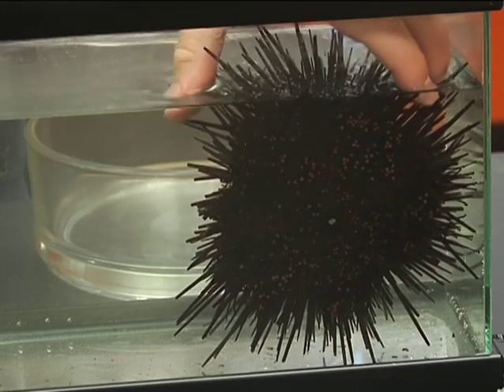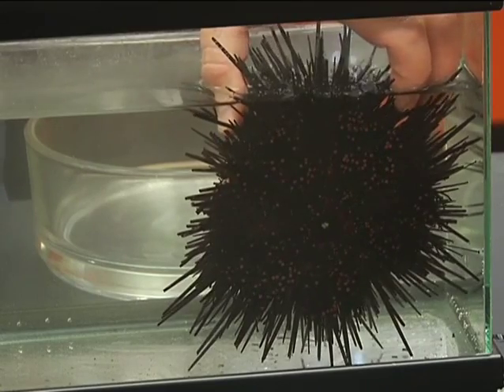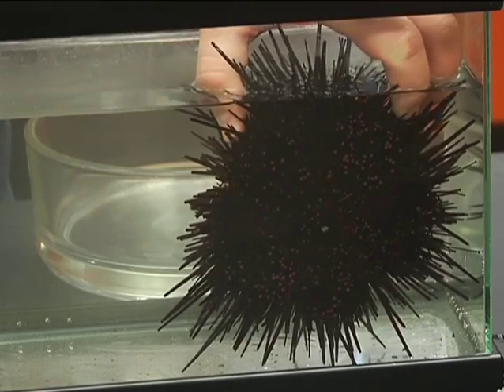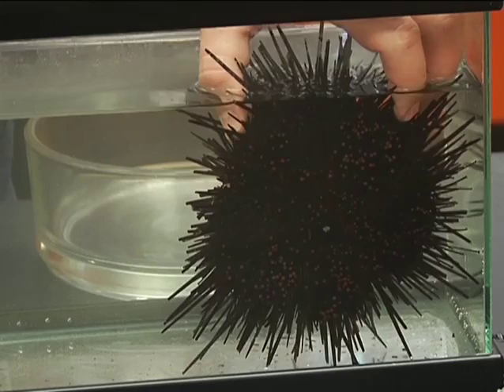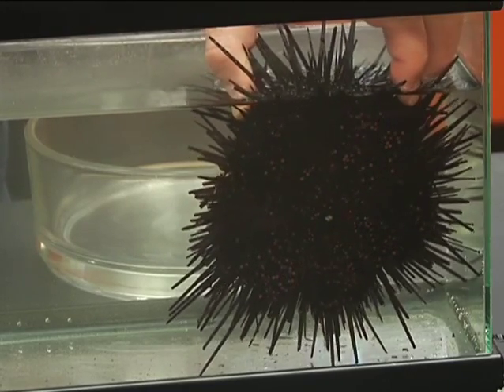To remove an urchin without breaking off some of its tube feet when it's stuck to something like this, you need to insert your fingers down to where the test is, beyond the spine, and rock or twist the urchin back and forth like you're twisting a dial. Just a little bit at first, and then more and more until it releases.